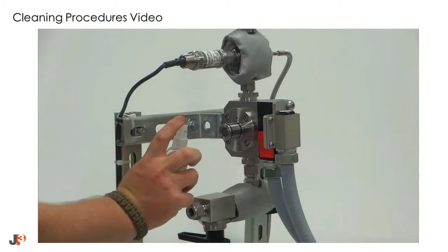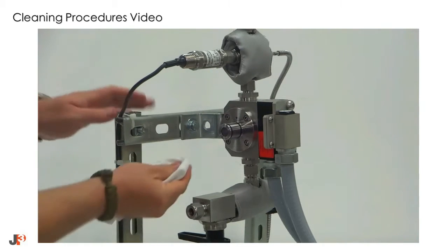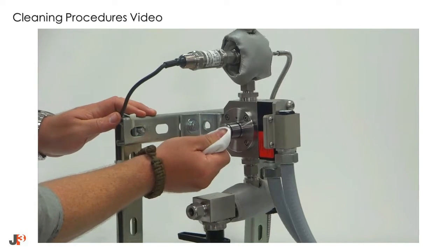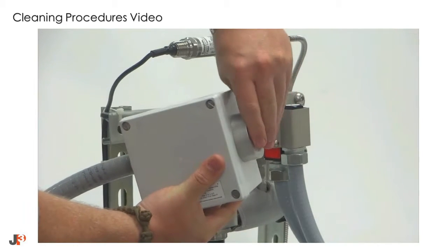Once both O-rings are installed, clean the outer surface of the sapphire. Again, use the JP3 lens cleaning spray and a lint-free cloth.